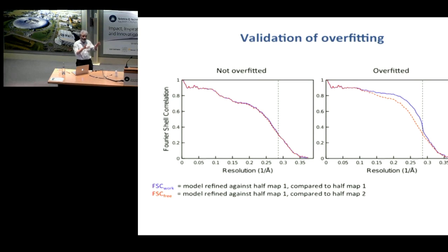We use half the data because it was available, and it showed that it is one of the ways of reducing overfitting. Removing overfitting is impossible. If you want to use a quarter of them, take a quarter. If you want to take 10%, take 10%.